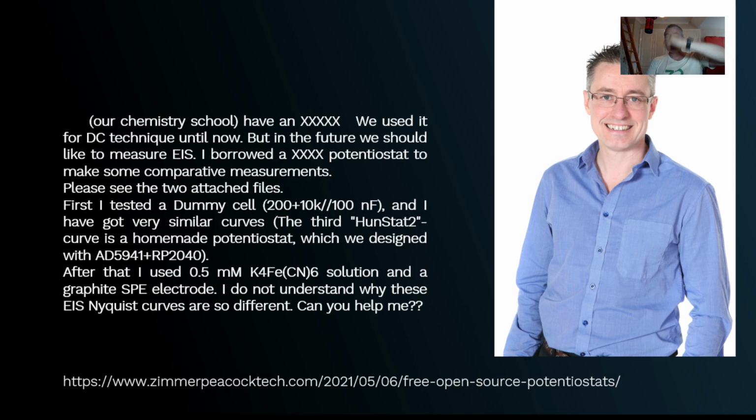But I do understand that there's also value in developing your own electronics for educational purposes. And I want to say that because potentiostats these days are almost commoditized. There are so many vendors now in the potentiostat world that it's a very commoditized kind of technology. I'm part of that, of course.